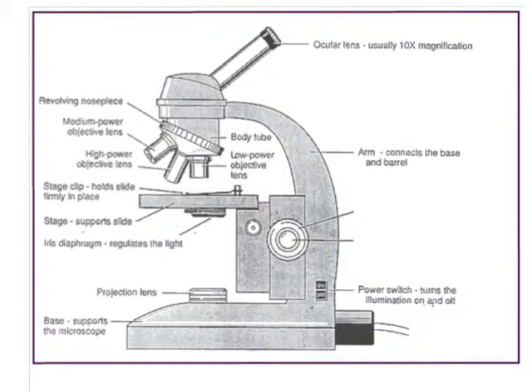The last item to mention is the focus. Right here, we have a knob that we can turn. The inner part will be the fine focus. The outer part will be the coarse focus. Some microscopes have 2 separate knobs for focusing. Sometimes the knobs are up here. Microscopes actually vary quite a bit from one to the next. So when we are in the practicum, ours may be a little bit different than this, but this is one fairly standard type of microscope.